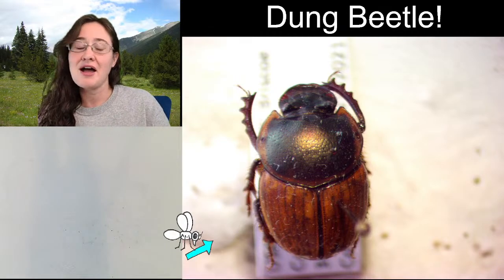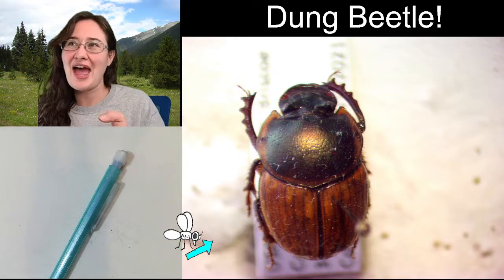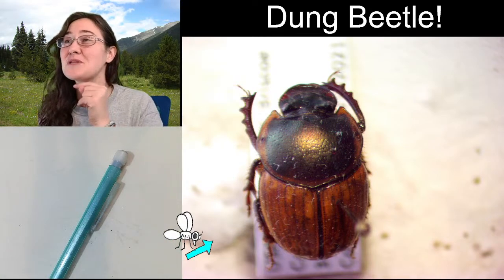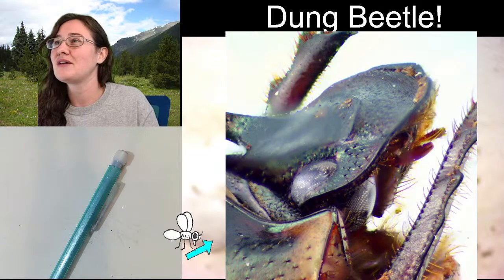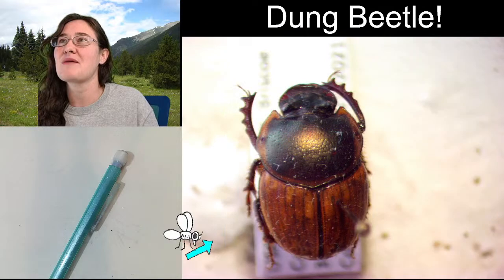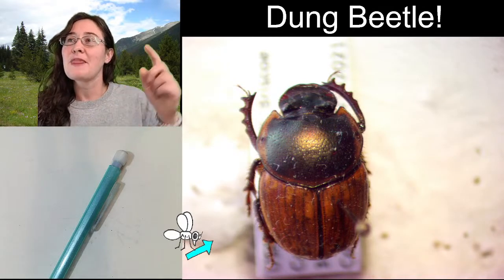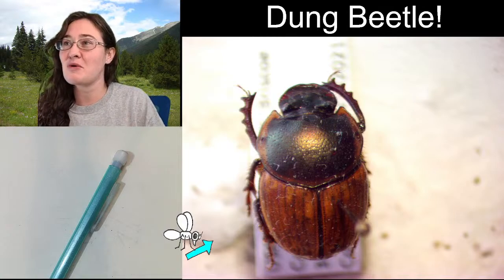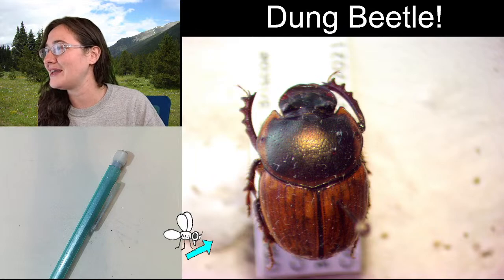And I was thinking that it's better to look at the head from a lateral point of view, because this one is actually a male and has horns. I'll show you really quick. Oh, the horns aren't great in that picture. I'll have to show you in real time. They've got these really awesome horns. So obviously we know he is a boy.